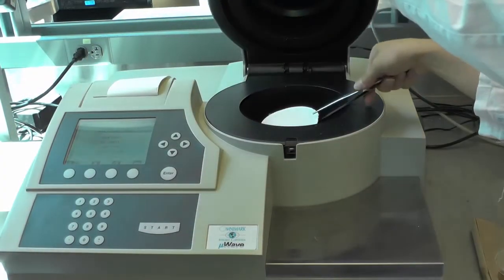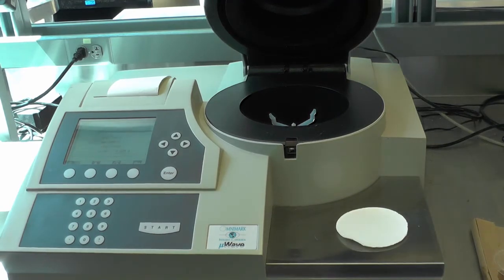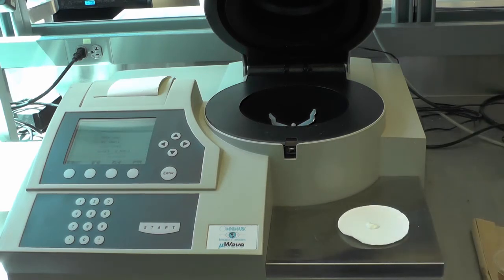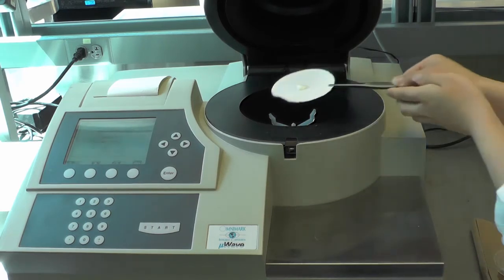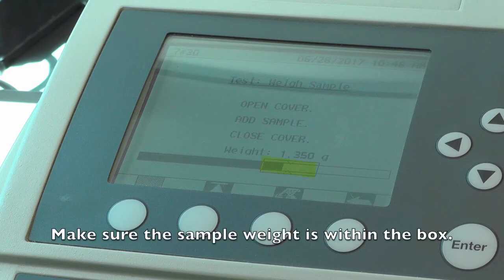When prompted, open the cover and add the sample to the pad. Please note that spherical samples such as grapes, cherry tomatoes, and eggs are not suitable for this instrument because microwaves can cause the sample to explode. The weight of the sample will be displayed in grams on the main screen, and a bar indicator will display how close the sample weight is to the desired preset weight outlined by a rectangular box. Adjustments to the weight can be made as needed.